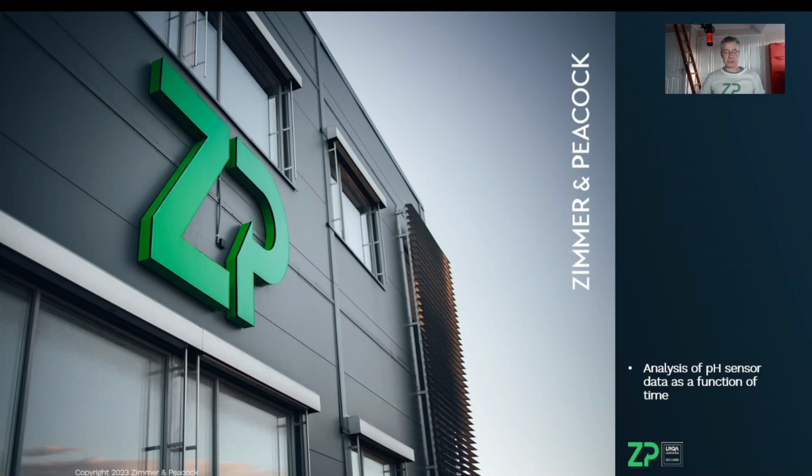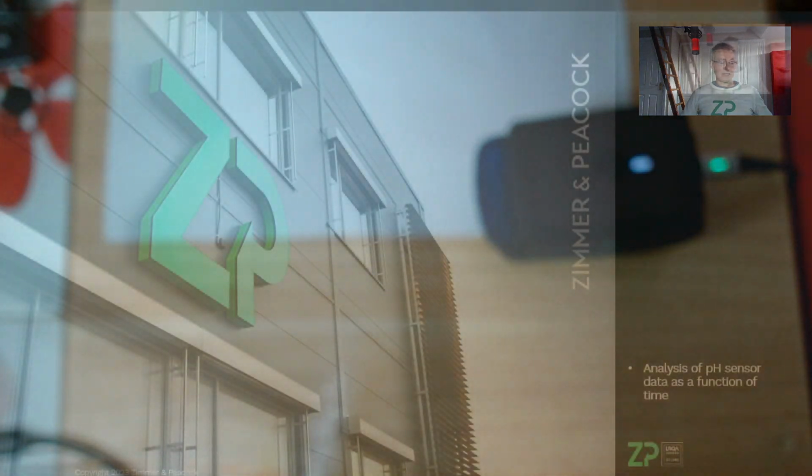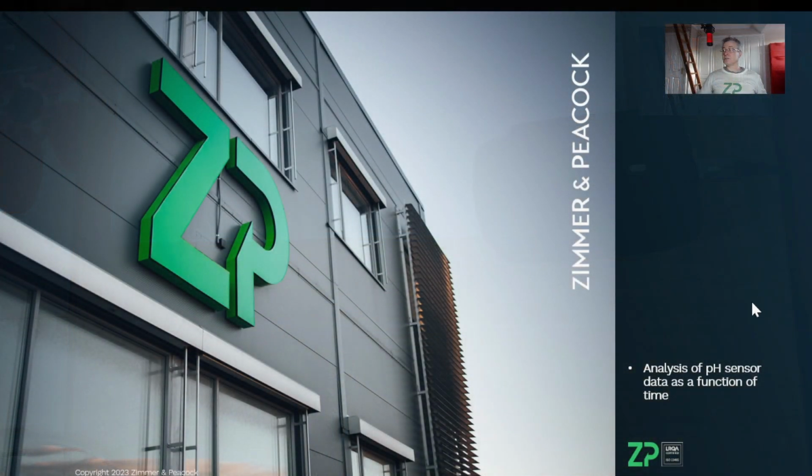In this quick video, I'm actually going to talk about pH sensors. I was about to hold one up, but I realized I'm actually going to hold up a sheet of pH sensors. This is to give you a sense of the scale of manufacturing that we are able to achieve with this kind of technology. So you can see that I've got a sheet of the pH sensors here. And with that said, let me dive back into the video itself.